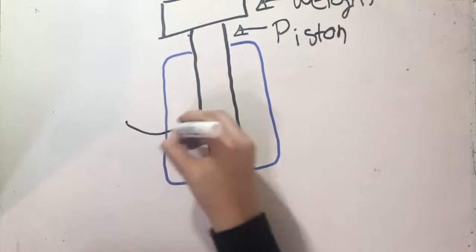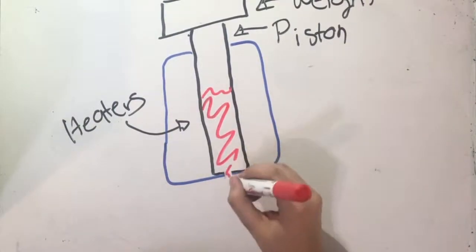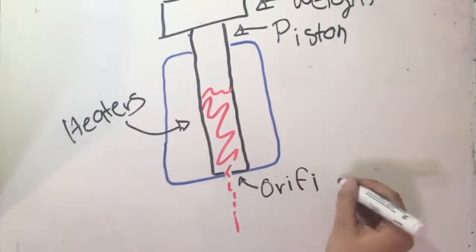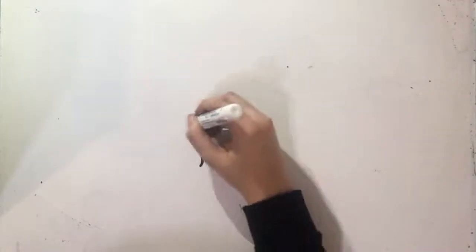barrel bottom. This technique is done at a fixed pressure, temperature, and weight, dictated by ASTM, American Society for Testing and Materials. This method, D1238, establishes the condition for each polymer by doing this test. You can determine the apparent viscosity and know if the resin is the one that you need.